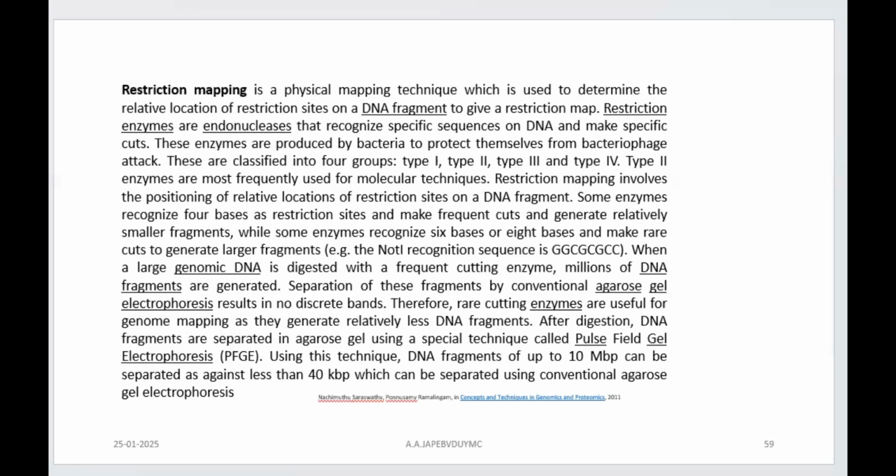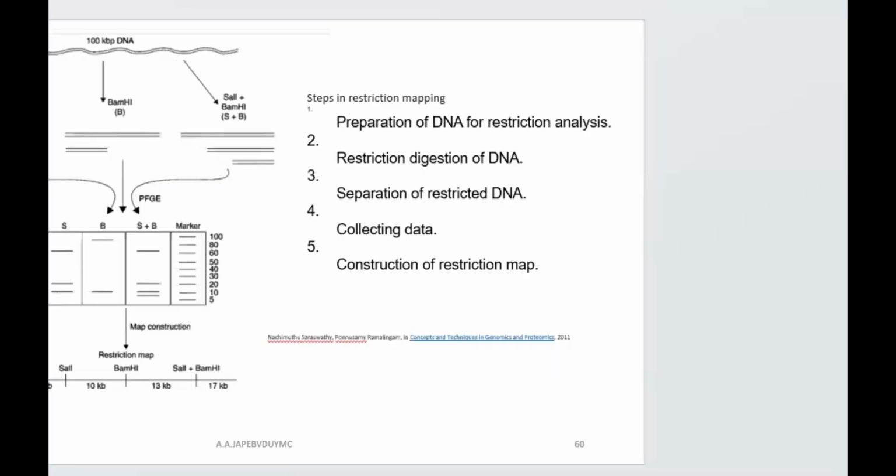So you can take help of restriction enzymes, then generate the fragments, then these fragments are run over agarose gel electrophoresis, they will give you bands. So these bands are compared with the ladder bands, the bands generated by the ladder, and then you can find out the relative size. You can estimate the relative size of the molecule. So that is what is restriction mapping of the DNA. That is one of the applications, right?